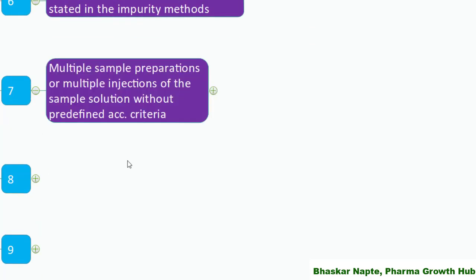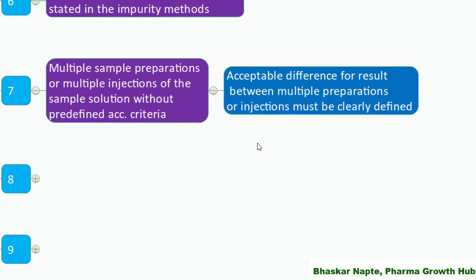The next point: multiple sample preparations or multiple injections of sample solutions without predefined acceptance criteria. In some cases, the method of analysis mentions duplicate sample injections for assay, which is not a problem, but do you have suitable predefined acceptance criteria to accept those two injection results? For example, the difference between two assay results should not be more than 2%. If following multiple injections or preparations, clearly mention the predefined acceptance criteria so results can be accepted or invalidated.